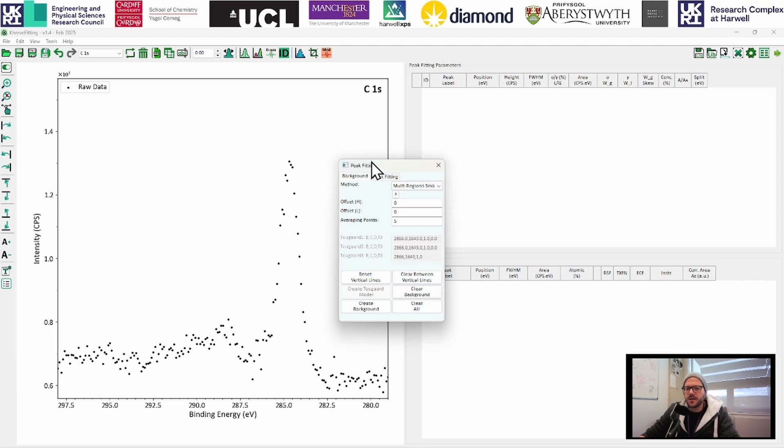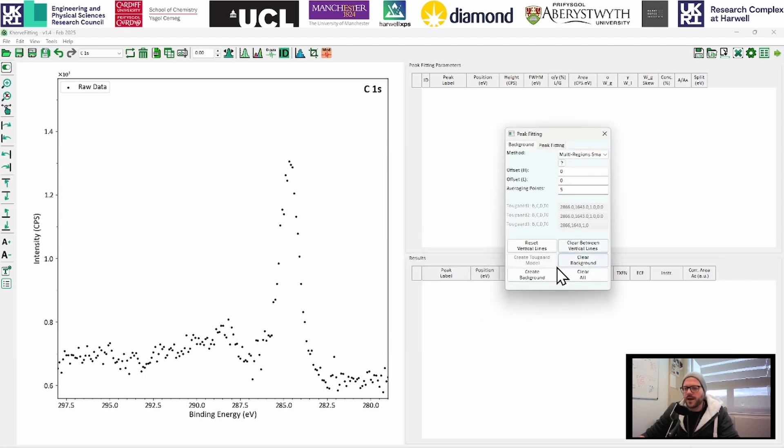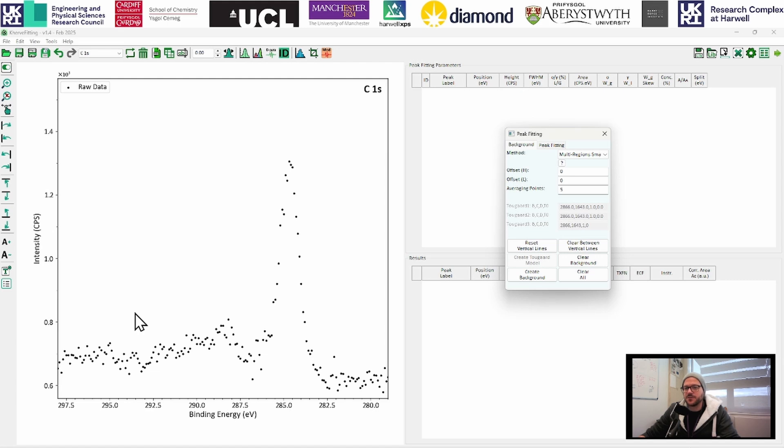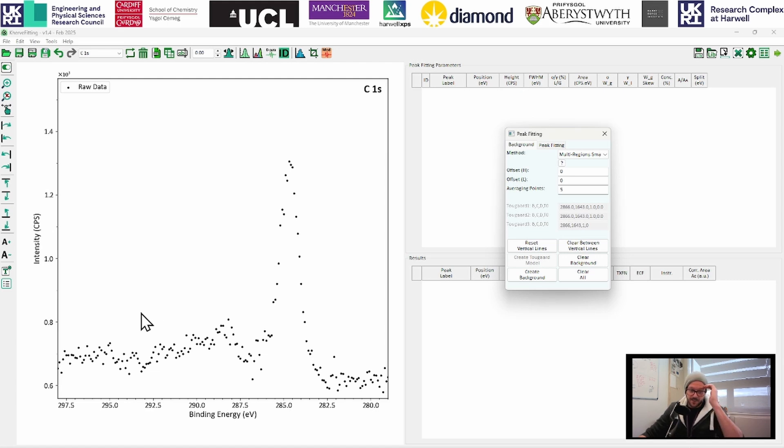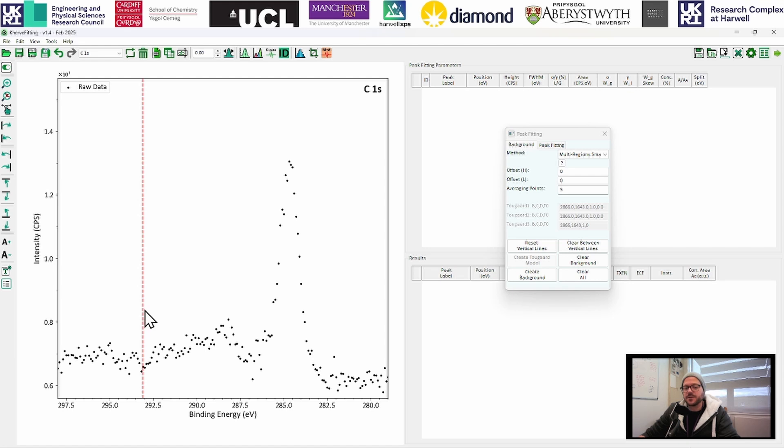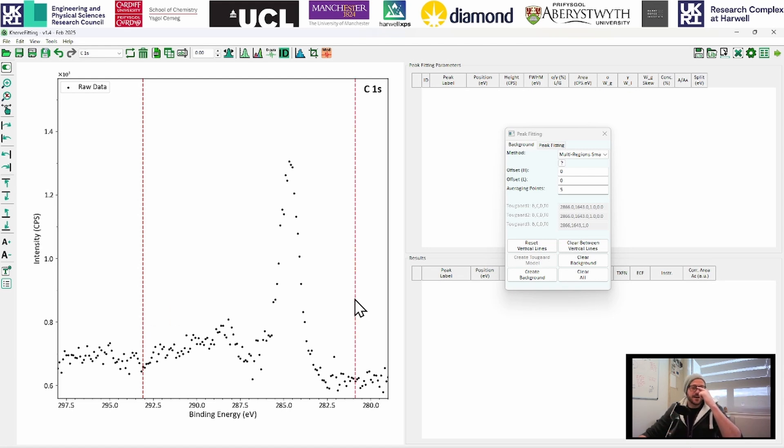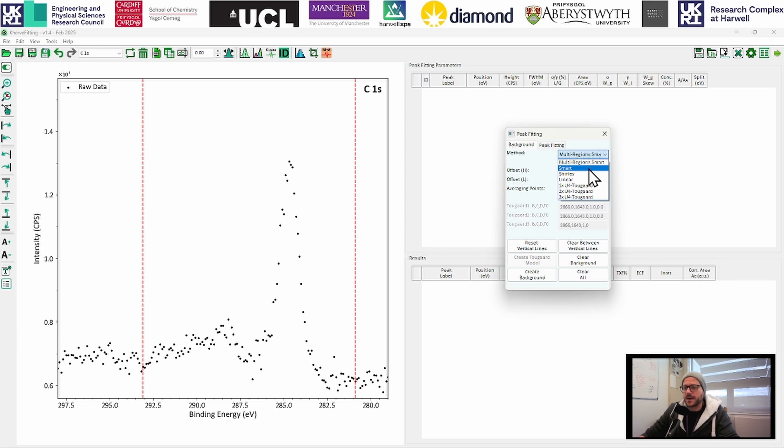When we do this, if you're familiar with Avantage at all, you will probably be pretty comfortable with this. If you're more familiar with CASA, then this might be a little bit different than what you're used to. But essentially, we're going to do pretty much something similar in that we choose a start and end region. And then we choose a background type.